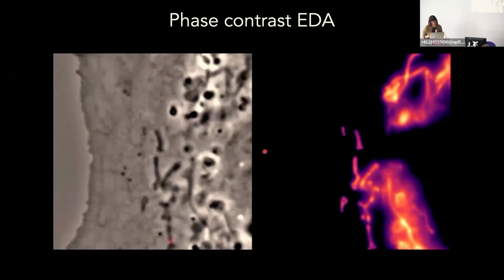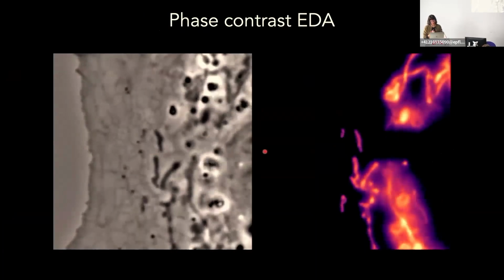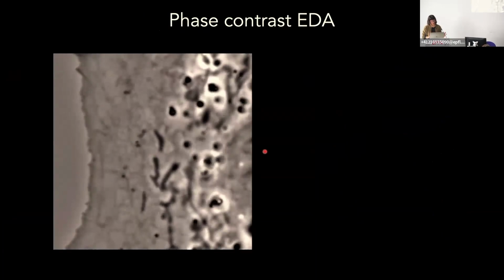And now we can turn on fluorescence just when mitochondria are about to divide to really reduce the light dose. In terms of phototoxicity, the light dose is near zero during the phase contrast imaging. So this is really a high gain type of measurement.